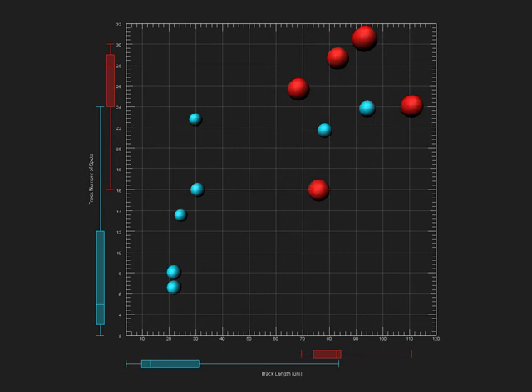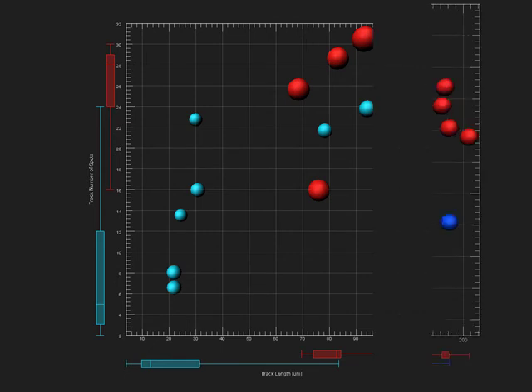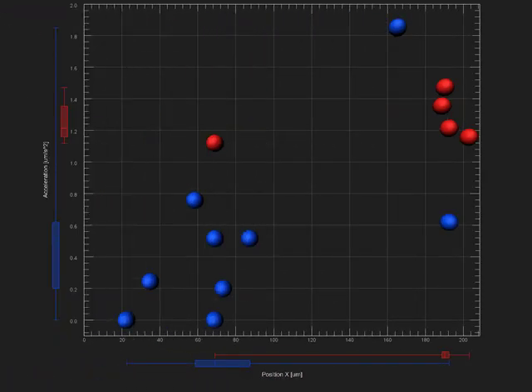By comparing position, range, median, dispersion, and skewness, they allow a quick visual assessment of multiple datasets. They help display the differences between populations without any assumptions of the underlying statistical distribution. For ease of comparison, the color of the box plot corresponds to the color of the Surpass object used as source data.